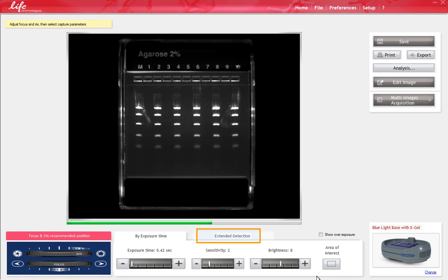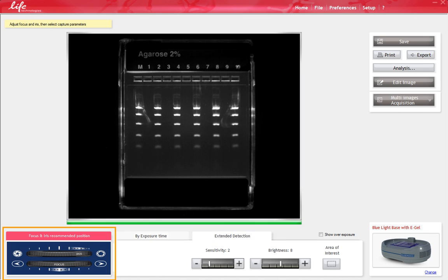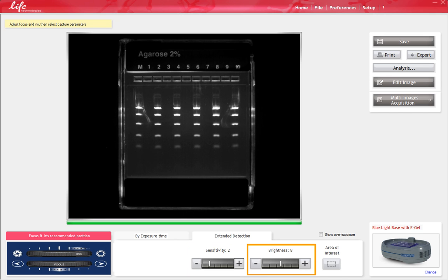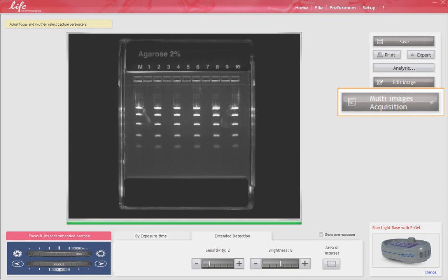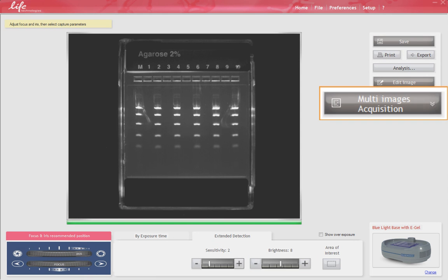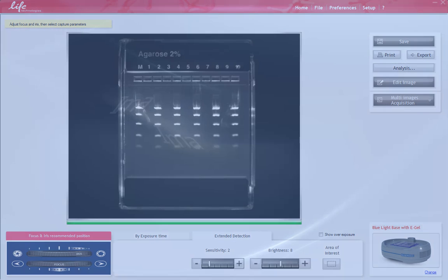In addition, the extended detection feature is unique and allows you to increase the dynamic range of your image. By making fine adjustments to these settings, you can optimize the image of a single picture or perform real-time imaging of a running gel by using the Multi-Image Capture feature.